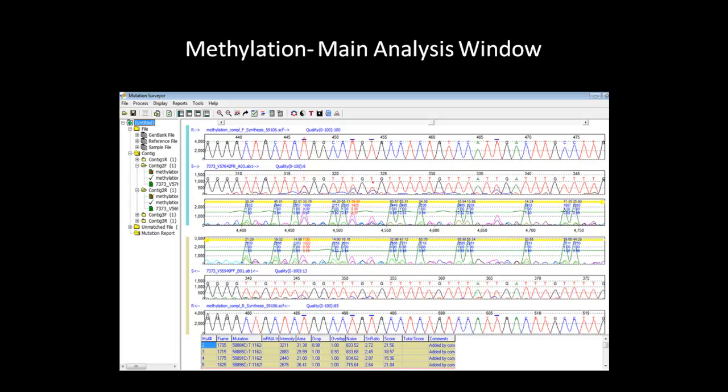Mutation Surveyor reads all uracil that were converted from the unmethylated cytosine as T's. So in this window, the horizontal blue bar on top of the T nucleotides indicates that they were originally a cytosine. At this position, you can observe that there is only partial conversion of the cytosine to uracil. These mutations are not in the CpG island and are called as regular mutations because the amplicon cytosines were converted to uracil and read as thymine in Mutation Surveyor. Therefore, these positions are called as mutations because they differed from the reference sequence.